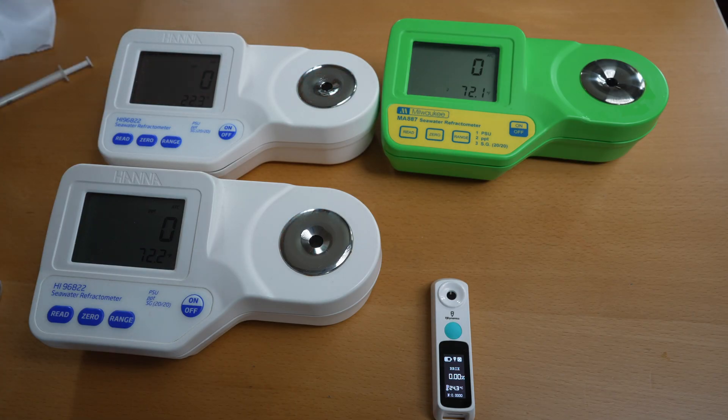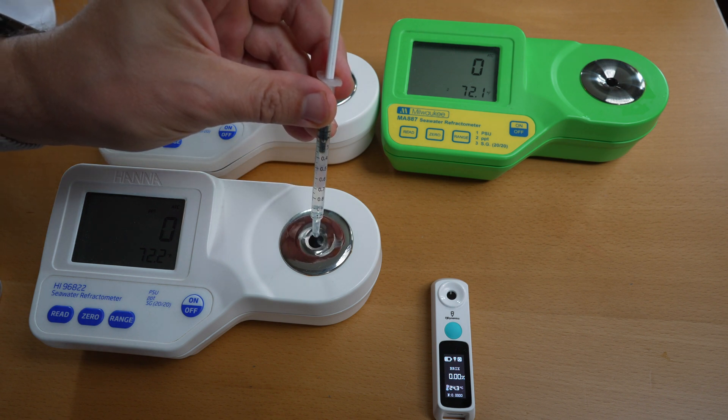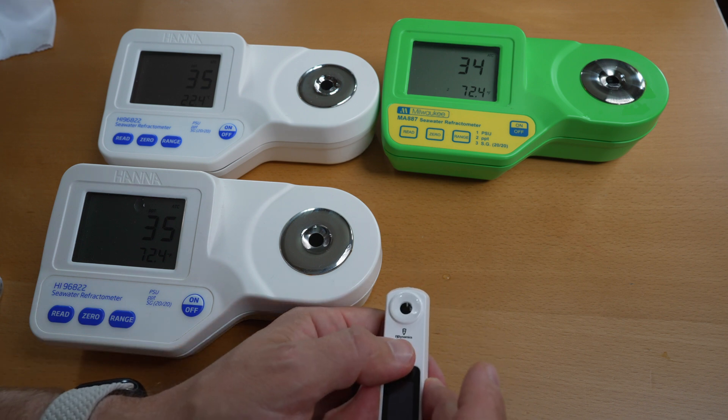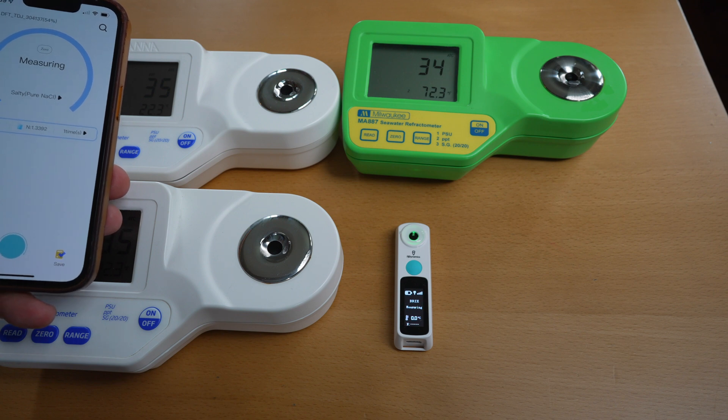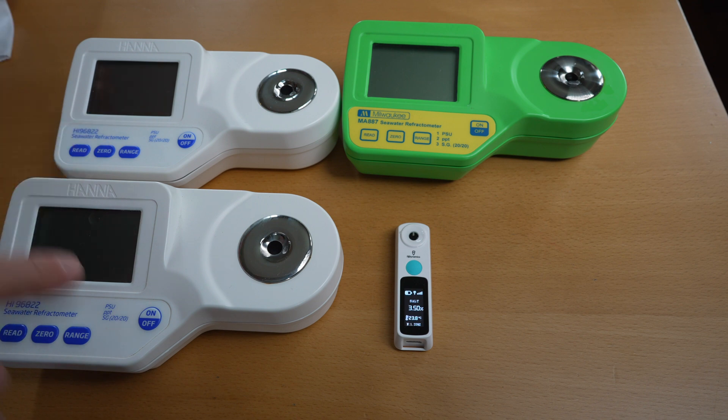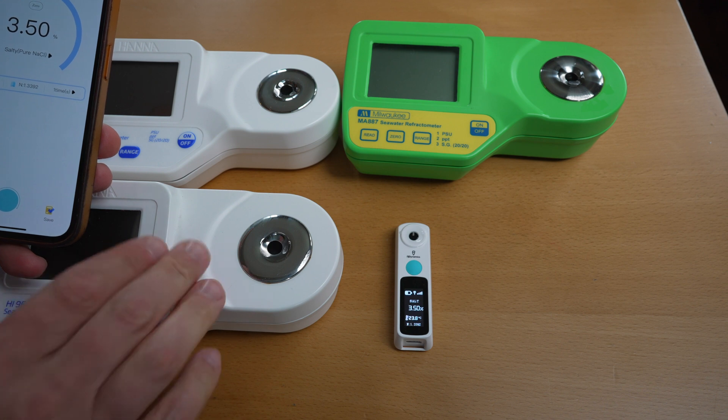Now that I've dried all the units I'll apply real test water from one of my aquariums on all of them. I'm taking my time to let the temperature calibrate, and now let's actually measure. Pressing read on each — you can see all of them read 35, or both HANAs read 35. The Milwaukee reads 34. Now pressing measure to see what the reading will be on this unit.